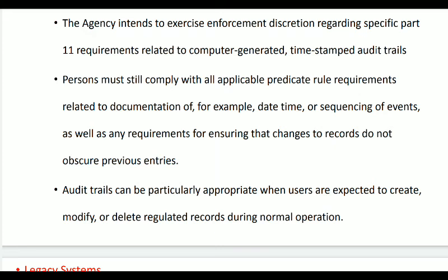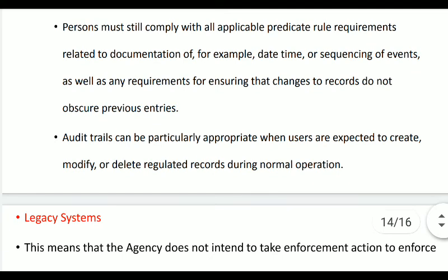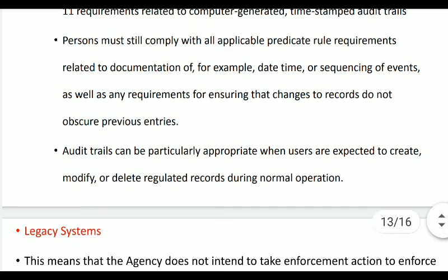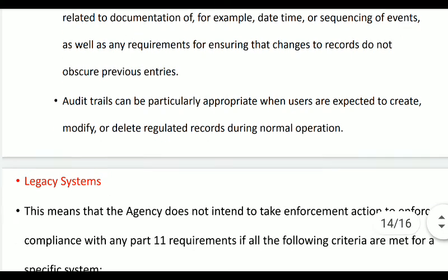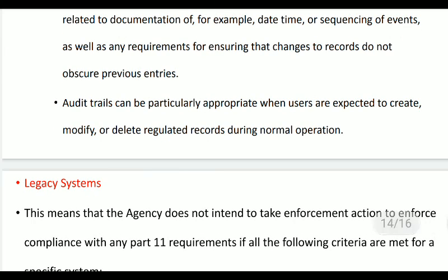This entire documentation you must retain in a proper manner so that it would generate a proper audit trail, and this audit trail is mainly asked for by the US FDA persons when they come for inspection. So this audit trail is nothing but a step-by-step generation of documentation with proper timestamps so that you can trace back to any particular step and check on which date it was performed and who performed that particular step.